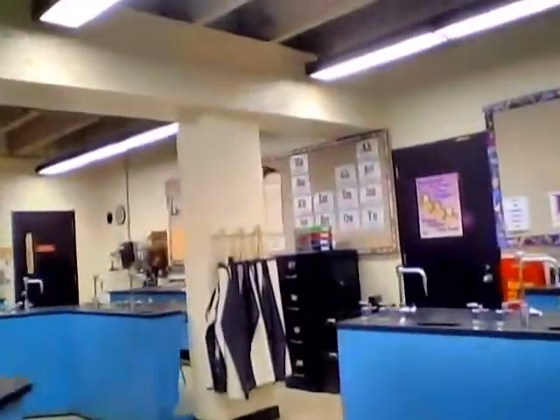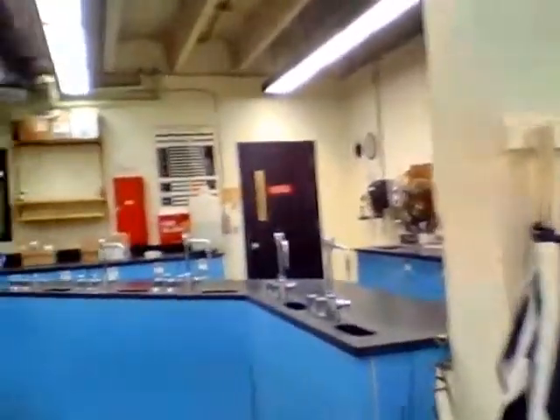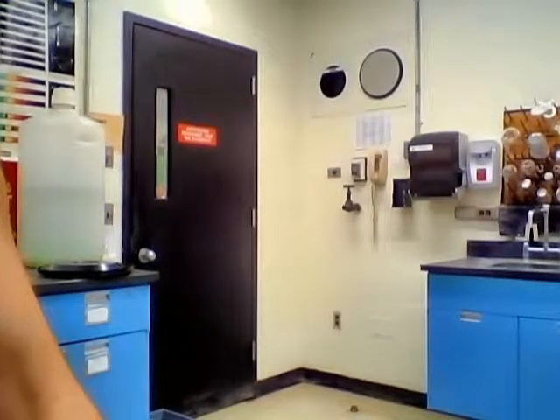Let's see, what else did we need? Oh, the aprons. Here are the aprons hanging up on the back hooks on the wall, which you probably noticed. And lastly, there is also an apron cabinet, which I should have pointed out before, and there is the sign for the lab aprons. Hopefully you can see that. There it is. Alright, I think that's everything you were supposed to pick out. So again, where to find the various safety equipment is important, as well as reviewing the safety rules.